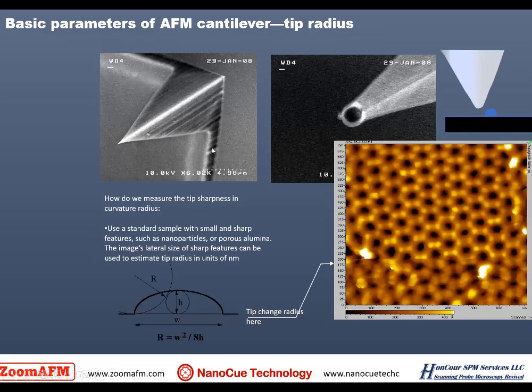Okay, so sometimes this is an SEM picture of the cantilever, and you can see this on the left is sharp, on the right somehow it is blunt. And then if we run an animation of this, you can see that the tip is actually traced along the radius of the particle we want to image. And if you look at the lower left corner, the actual image is the width of your particle plus the width of your cantilever. So if you have a dull, blunt cantilever, the particle is going to appear to be more thick than it is.